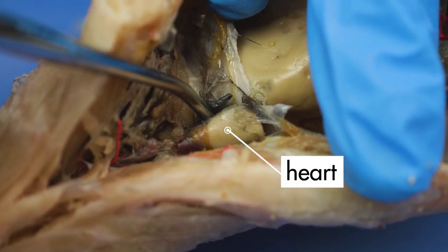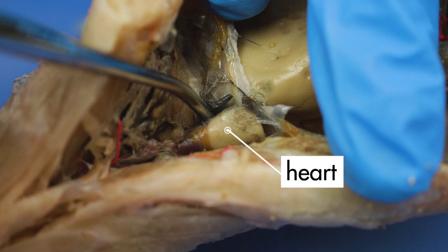A bony fish has a two-chambered heart, but the two chambers are difficult to distinguish. During this dissection, we discovered that the perch was created with several specific features that help it survive in its aquatic environment. In our next lab, we will look at another aquatic animal, the sea star. At this time, proceed with the corresponding activities.